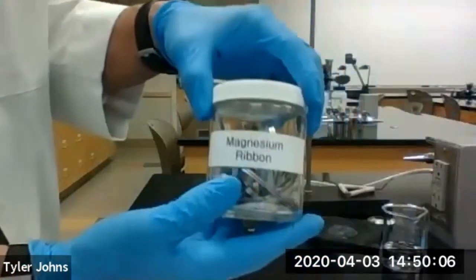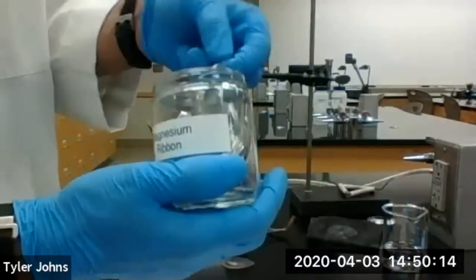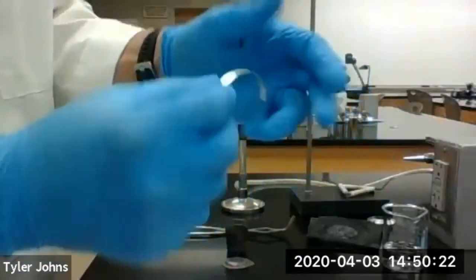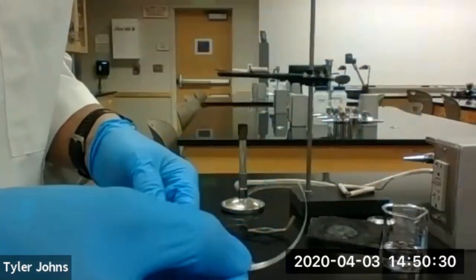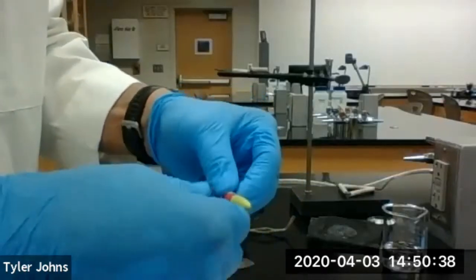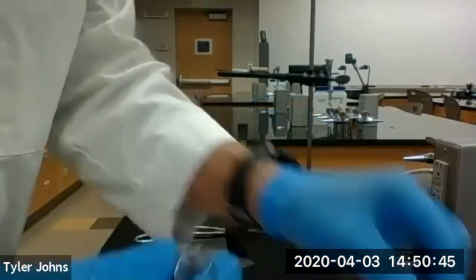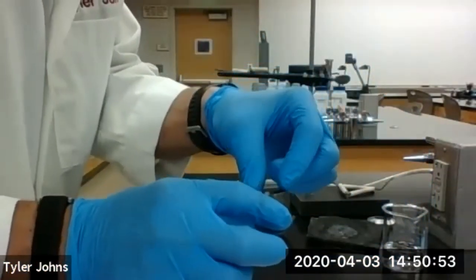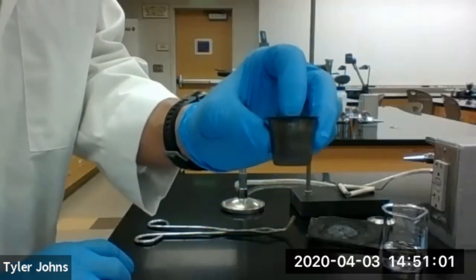Next we're going to obtain a piece of magnesium ribbon. Our magnesium ribbon is nice and shiny so we do not need to polish it with steel wool to remove any oxide coating. We're going to fold the magnesium ribbon — a good idea is to wrap it around a pencil. Here's our folded magnesium ribbon. We'll place it in our crucible.